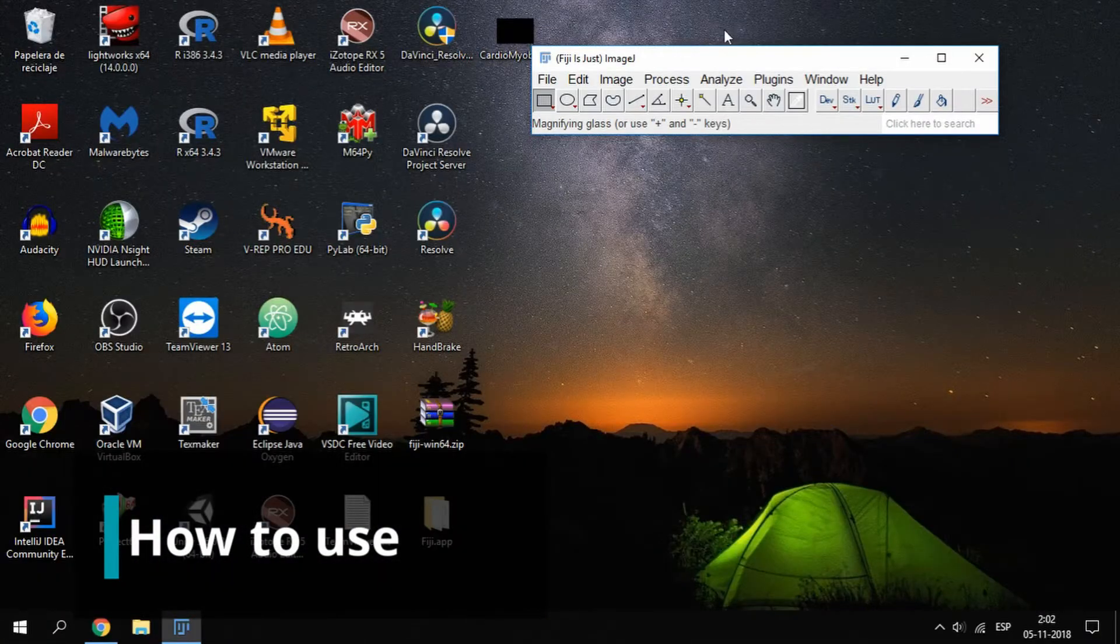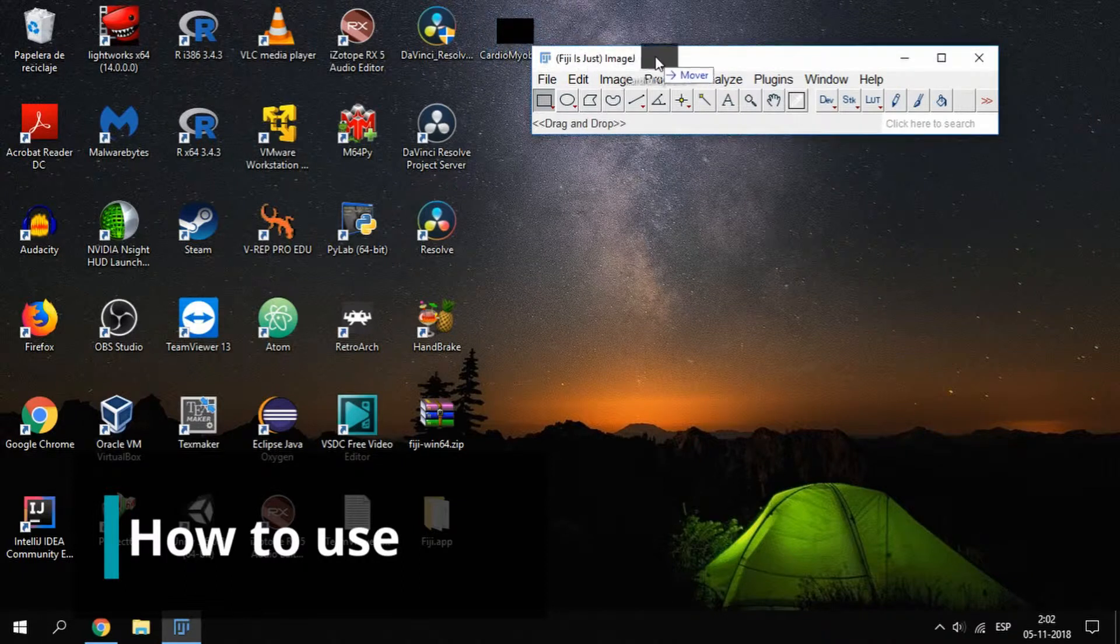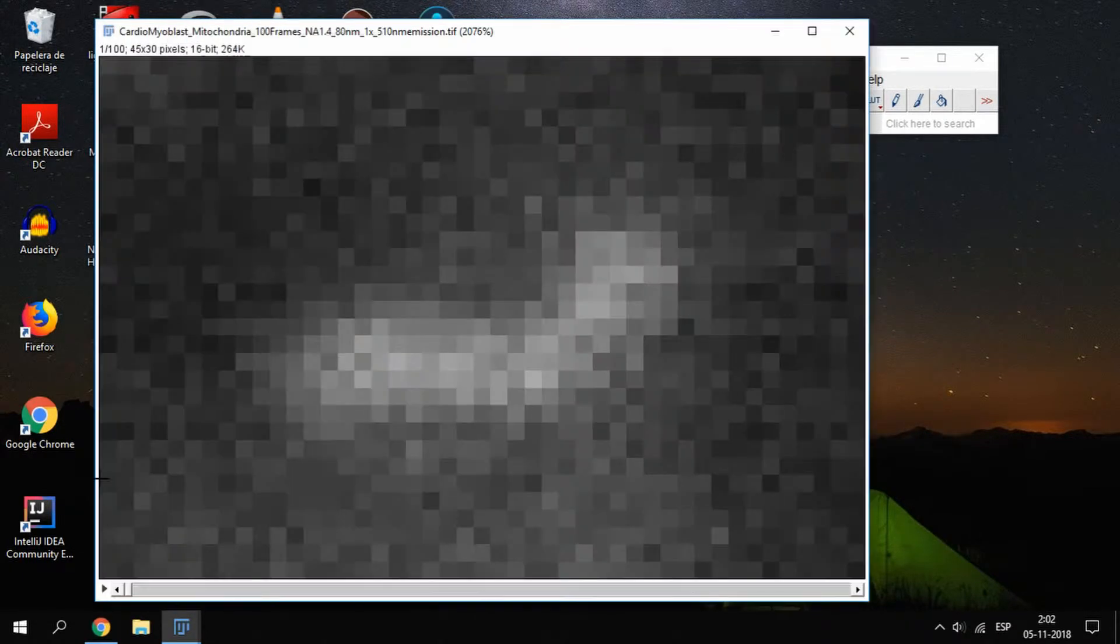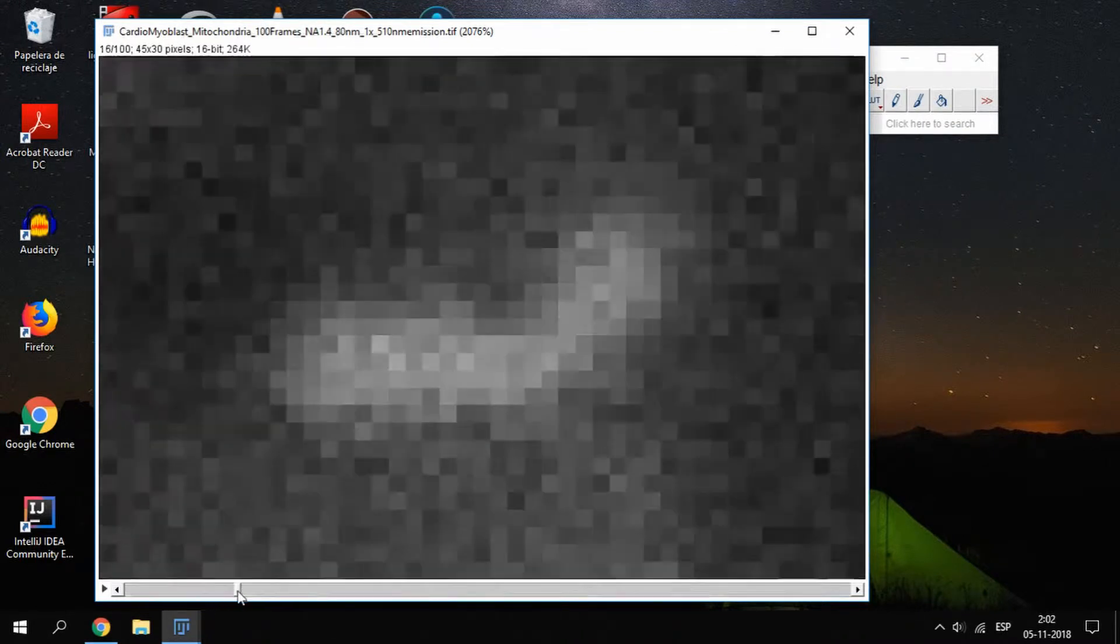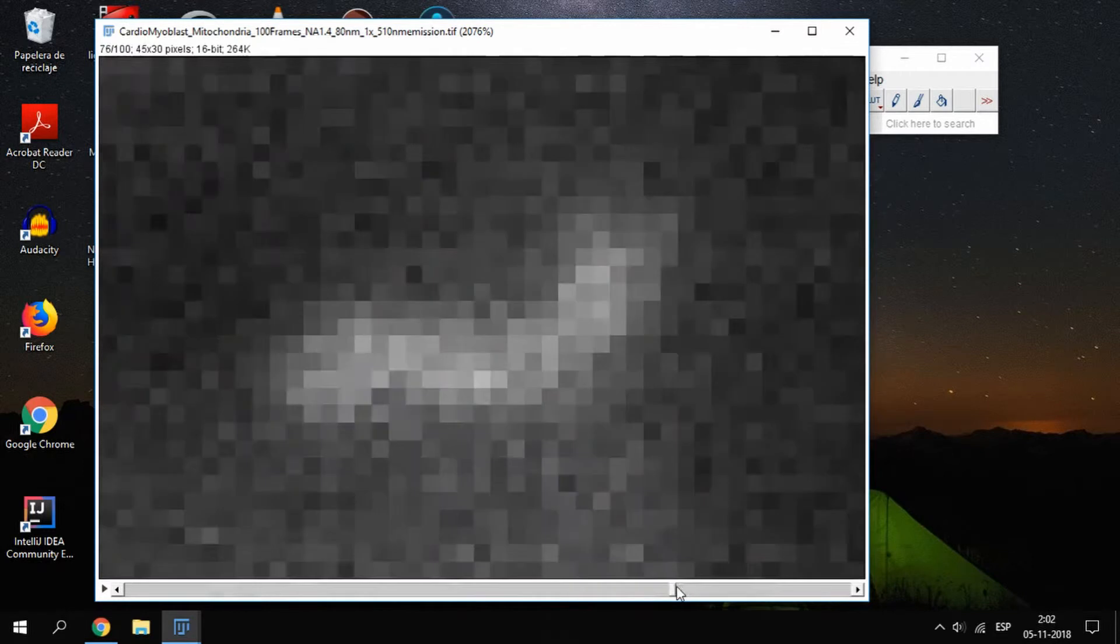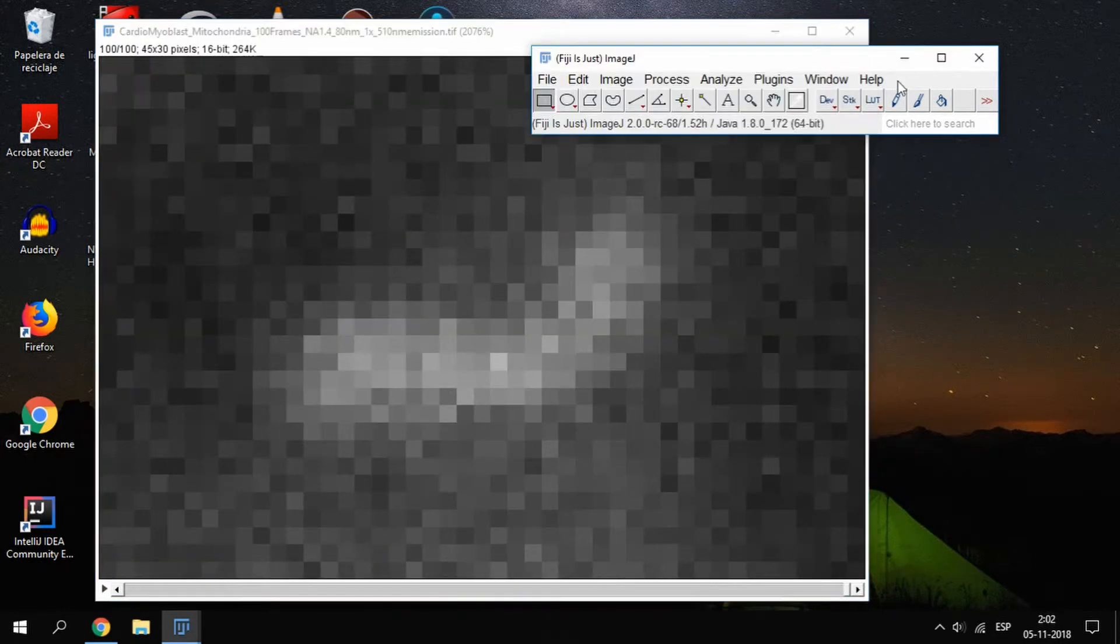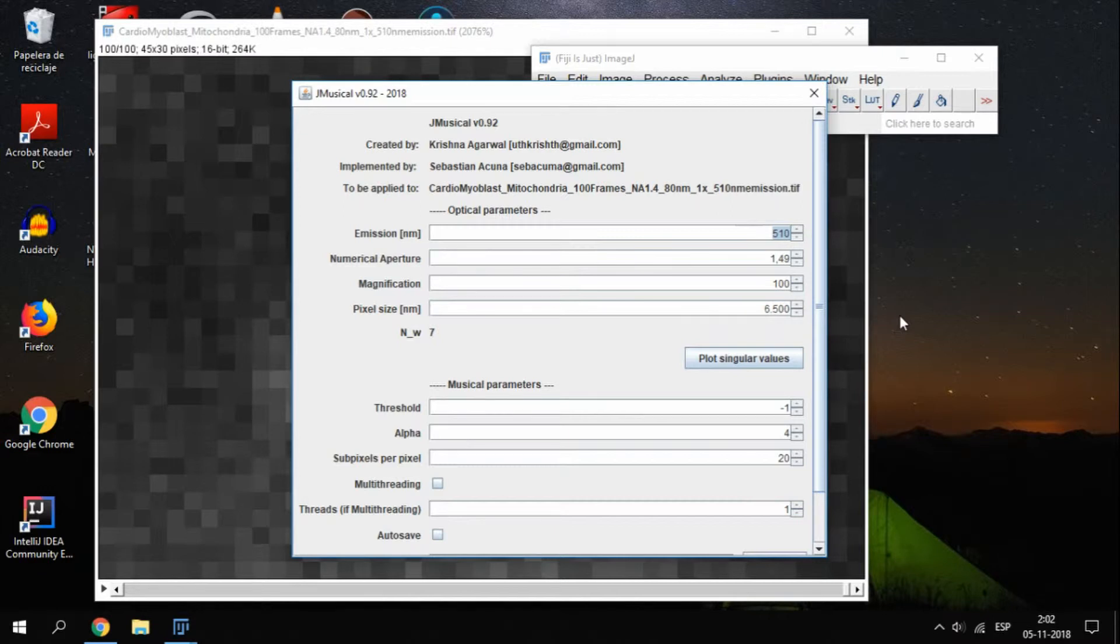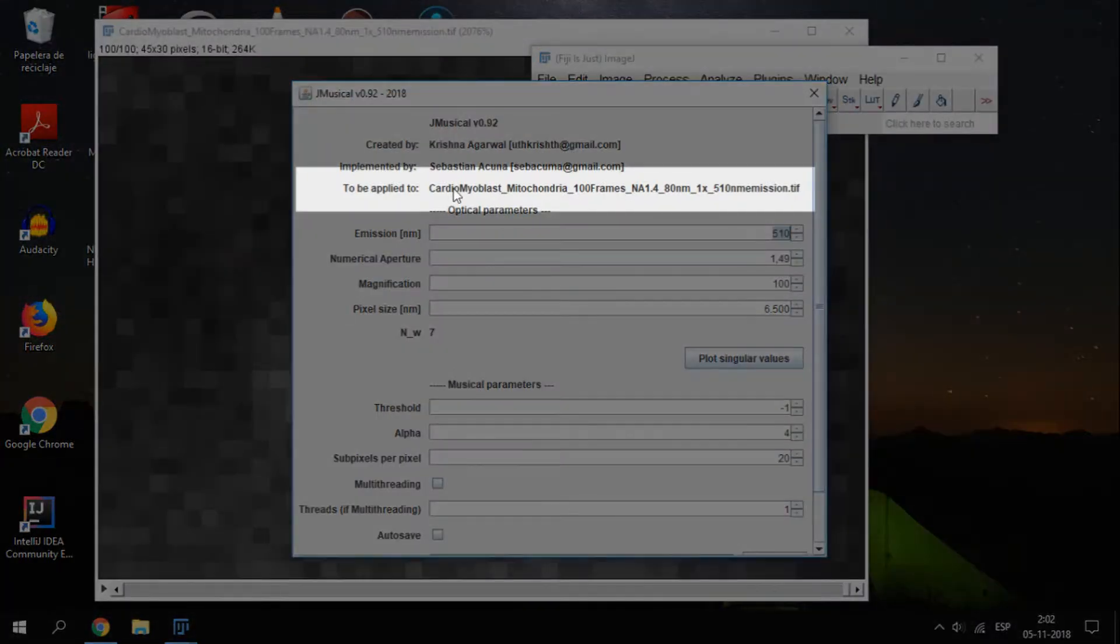To use the plugin, we need first to open an image stack. The format of this file must be xyt, meaning that the stack must be single color. Now with the image stack selected, go to Plugin Musical Musical UI. This will open the main window of the plugin. This window contains all the configuration parameters you need for the plugin, and the order of them is related to the normal workflow of using Musical. Before starting with the parameters, you can check that the image stack is correct, otherwise you will need to open the plugin again.